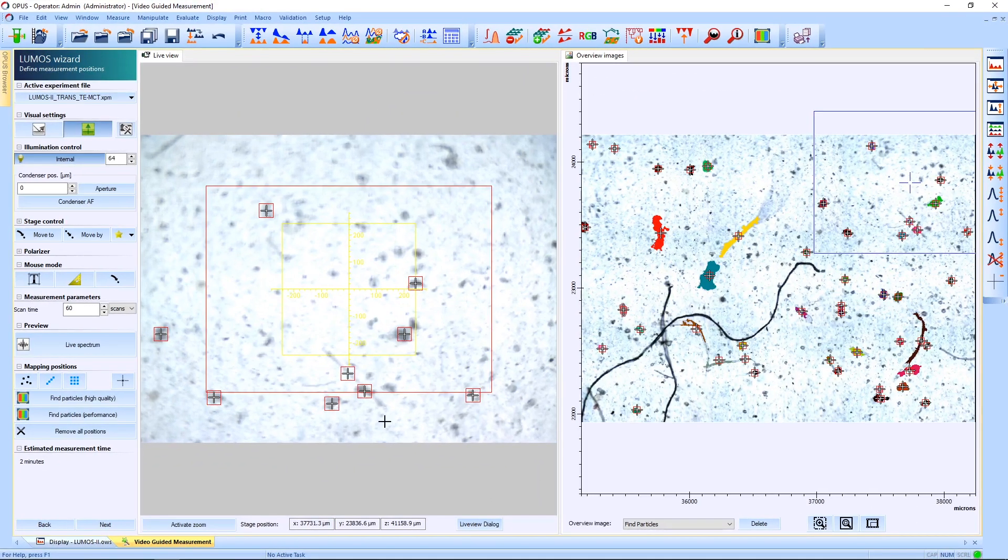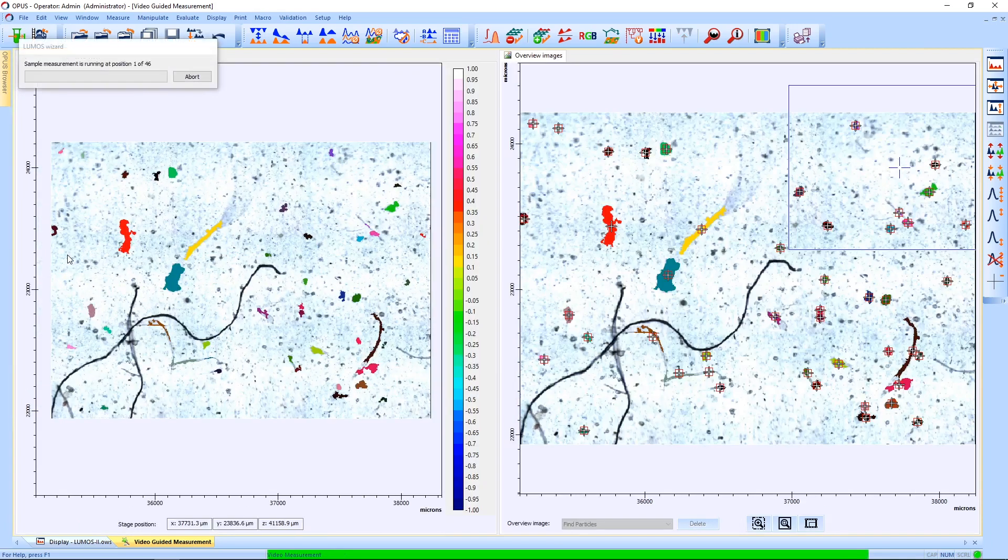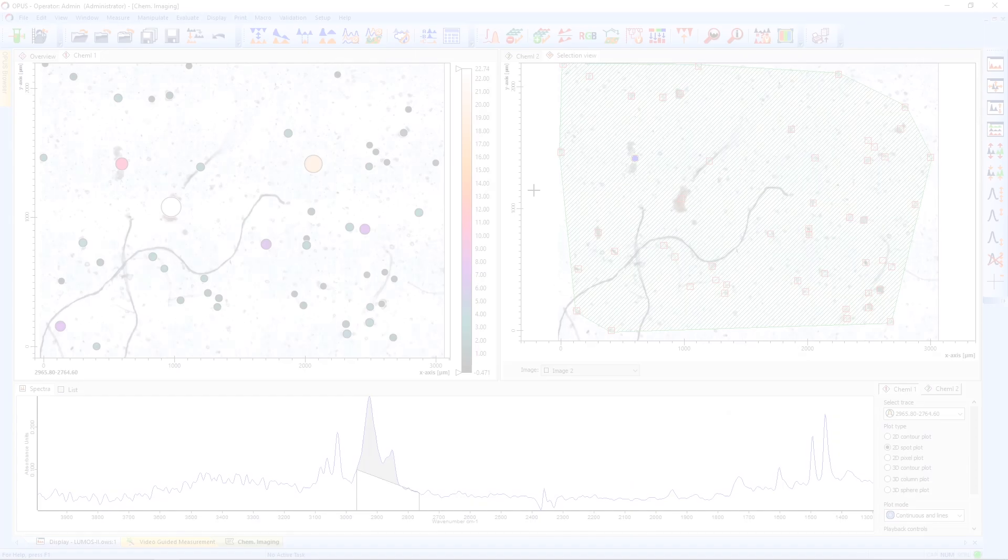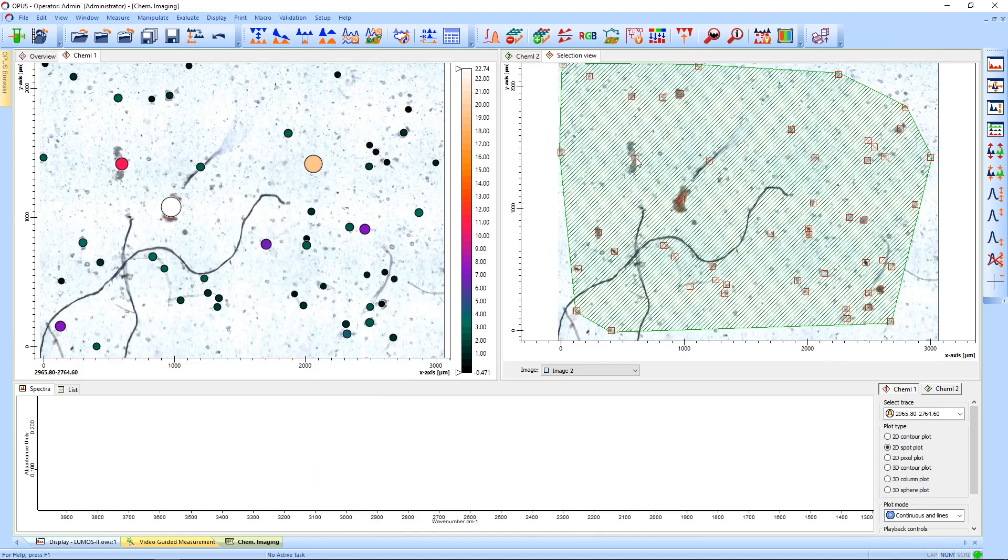So now all that is left to do is select a sample name and measure the sample. When the measurement is done, you are directed to the Chemical Imaging window. On the right-hand side, you see an overview over all the measurement spots and you can deselect and select them simply by clicking on them.